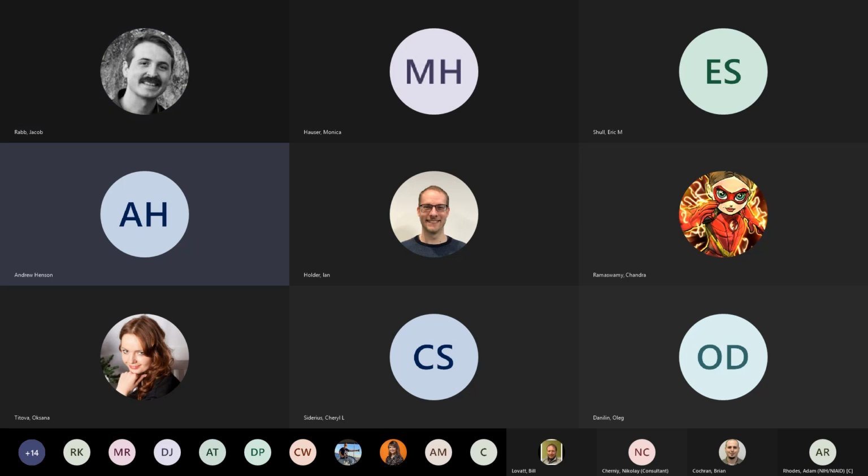I have a question. This is Andrew. I work for UK Biocentre, Milton Keynes, England. I'm quite new to LIMS, and I'd be interested to know a bit more about your, is it the developer program? So you can teach me how to do it.